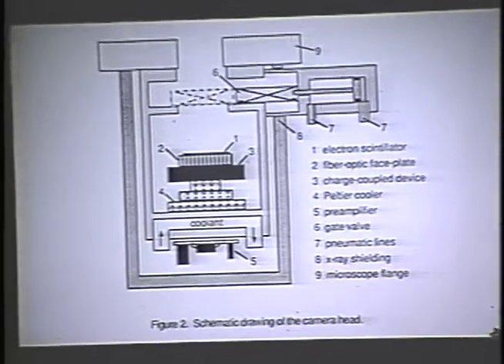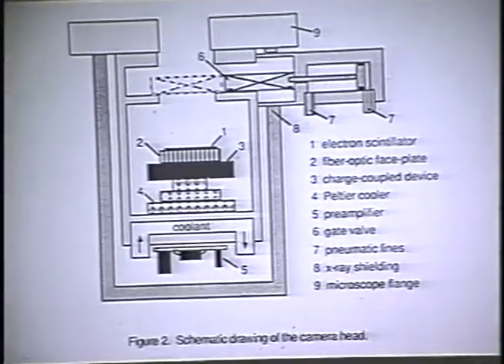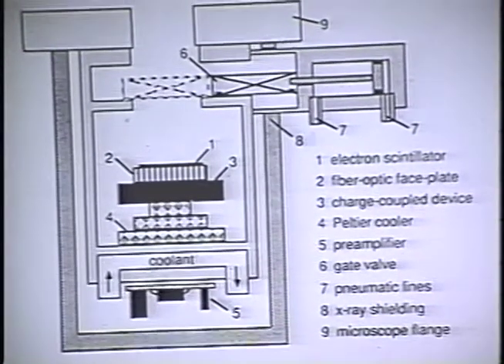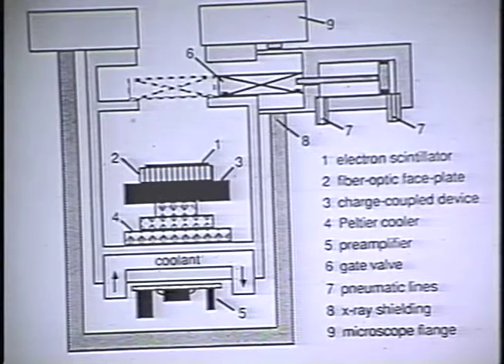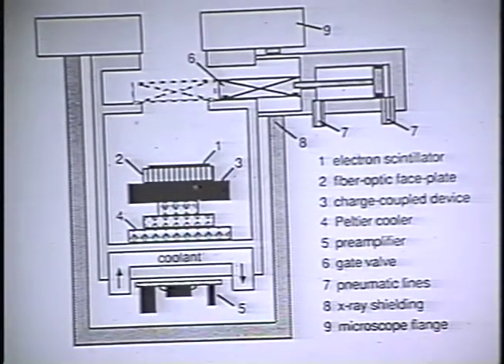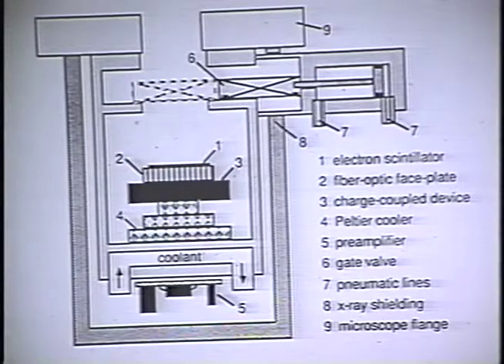This system was developed some years ago as a joint effort between our laboratory, Photometrics, and Gatan, and recently Gatan has started commercializing this design on their own. The system is shown right here. This is the CCD, fiber optic coupled to the single crystal scintillator.